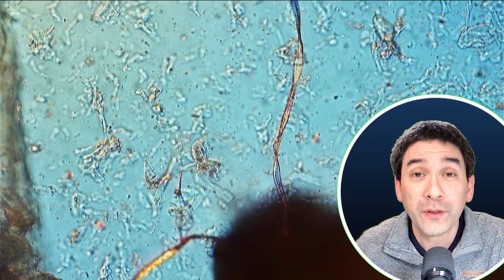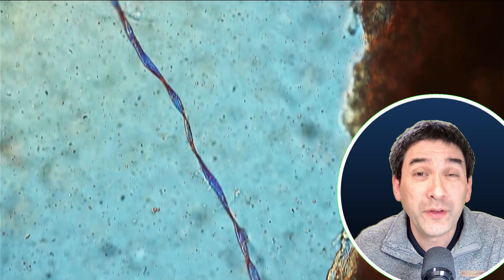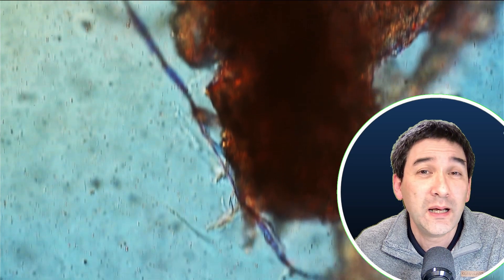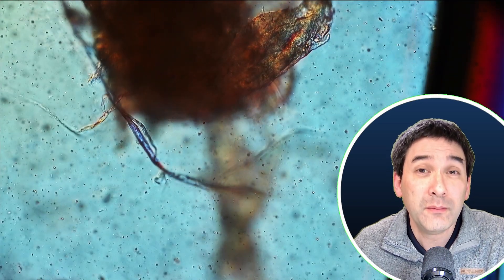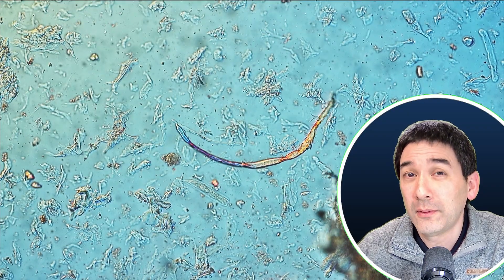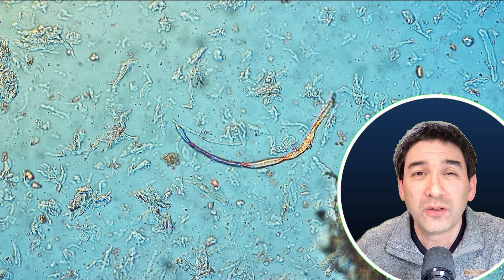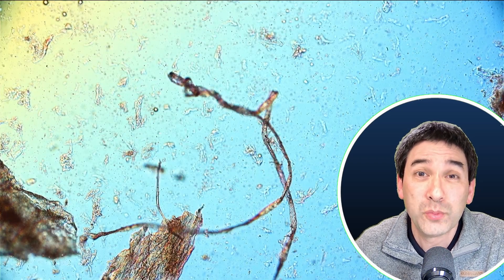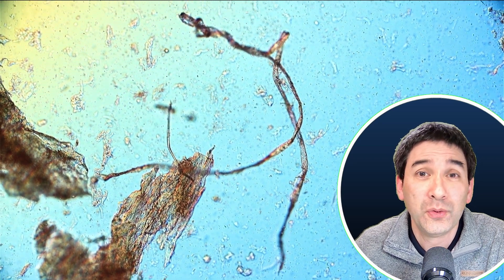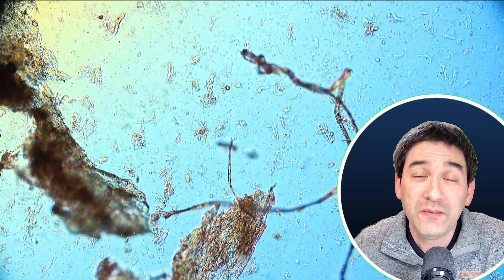I did not even have to look very hard for them, and some of them were fairly long. Some of the fibers could also be cellulose from clothing, but I think that some of these here probably are indeed synthetic. Some of them are even stained — some blue and even other colors. And a little bit to my surprise, they were not shredded up like the other parts of the specimen. All of the other particles you see are quite small, as the soybeans were kind of shredded and ground up to some kind of flour. But those microscopic fibers essentially survived this process and can now be found in the vegan meat.